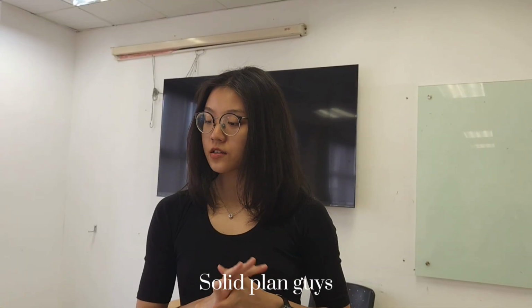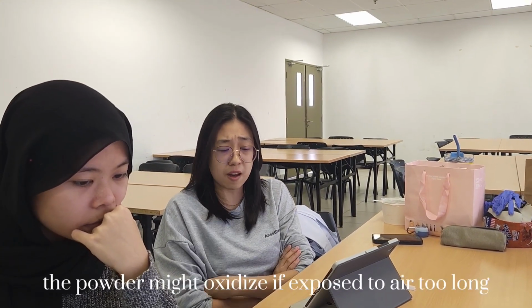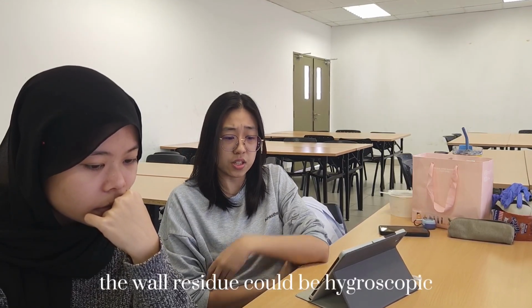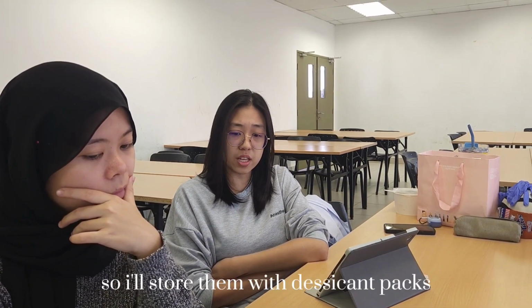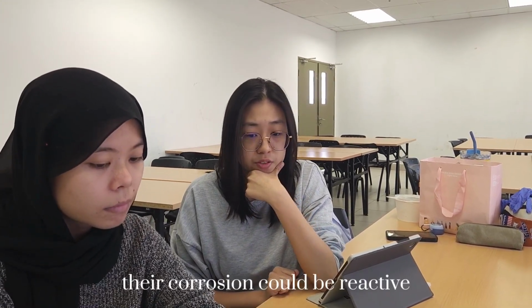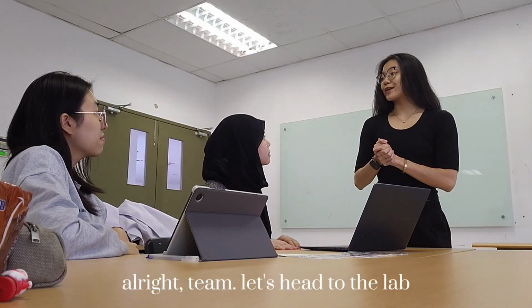Solid plans, guys. So Jacqueline, any risks or contingencies? The bigger risk is degradation. The powder might be oxidized if exposed to air too long, so I work under the fume hood. The wall residues could be hygroscopic, meaning they will absorb moisture, so I will store them with desiccant packs. For the metal tools, the corrosion might be reactive, so I will wear double gloves and safety goggles when swabbing it. Alright team, let's head to the lab.